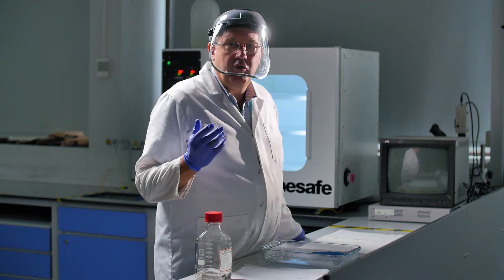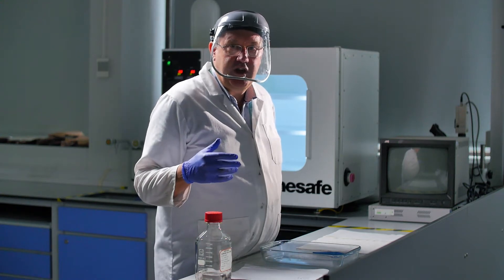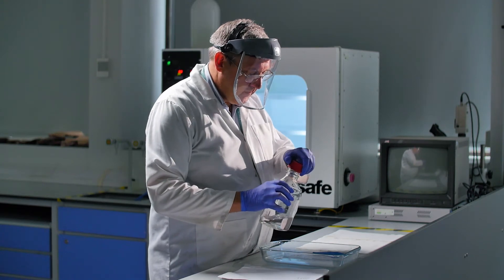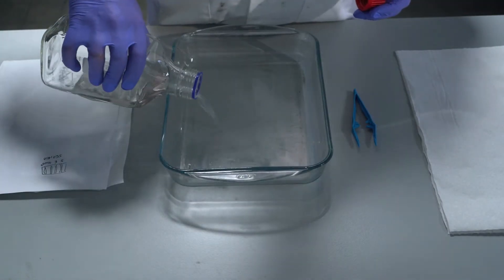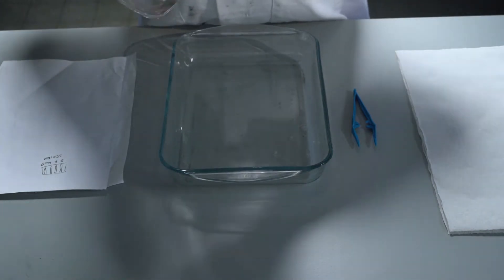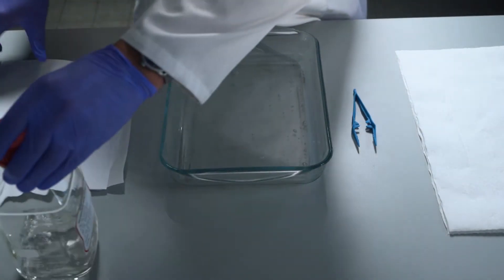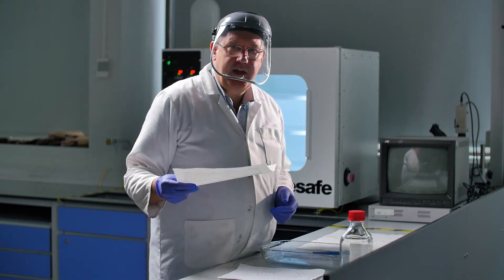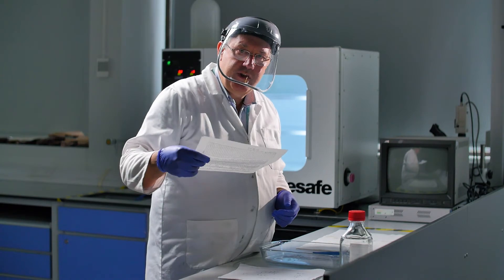So what I need to do is first of all put some of this ninhydrin solution in this processing tray. To treat the samples, I've got two bits of well-handled paper here I'm just going to pass them through this solution.